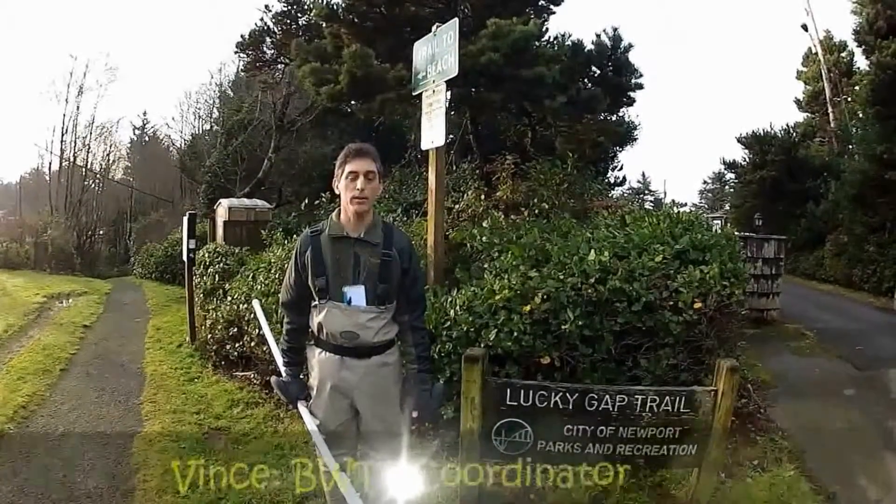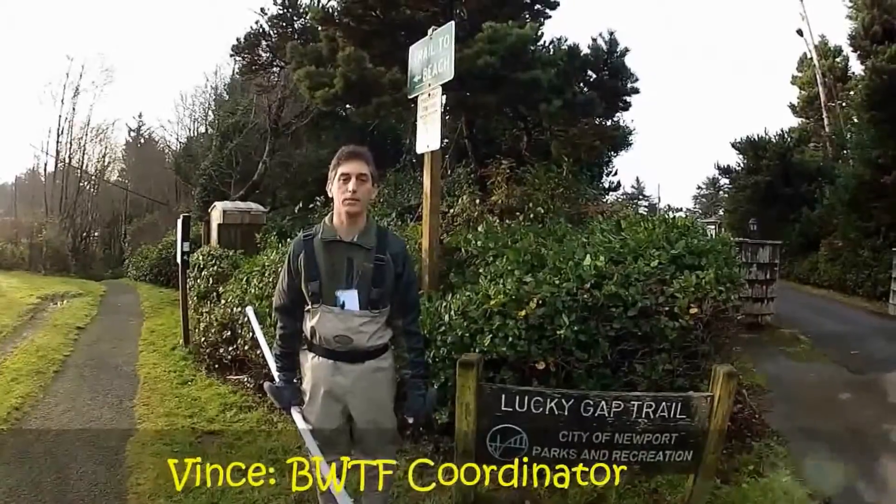Hi, my name is Vince and I'm from Surf Rider. I'm going to be showing you how to water sample at the Agate Beach site.